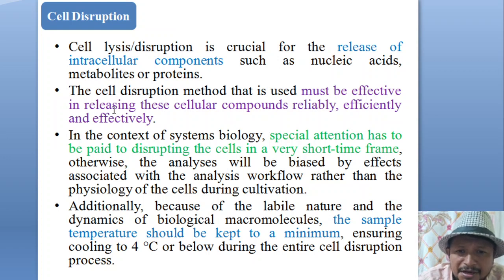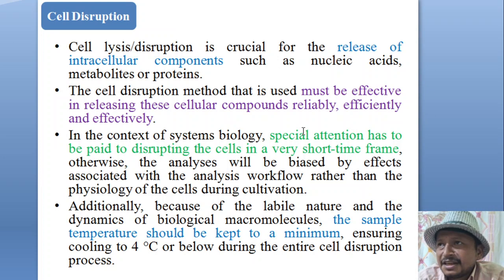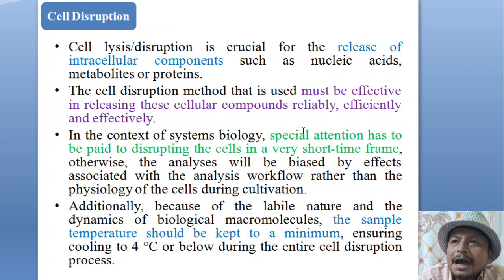So we understood that it has to be reliable, it has to be efficient, and it has to be very effective, right? And we have to take care of the time frame there. It should not take a long time. And again, we understood that we have to carry out the cell disruption methods at a very low temperature so that there are no bacterial or microbial contaminations or other contaminations.